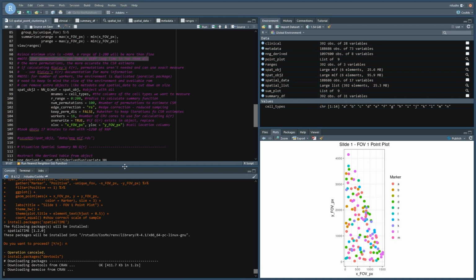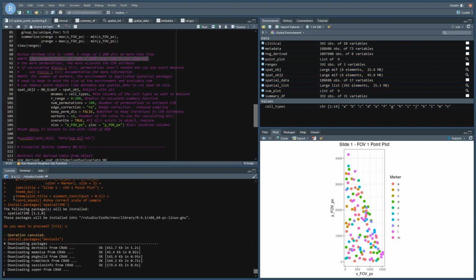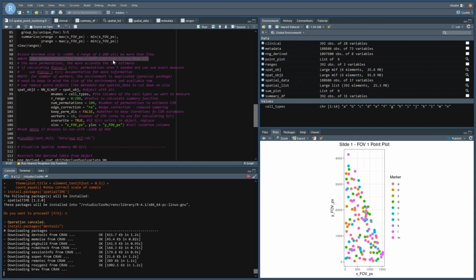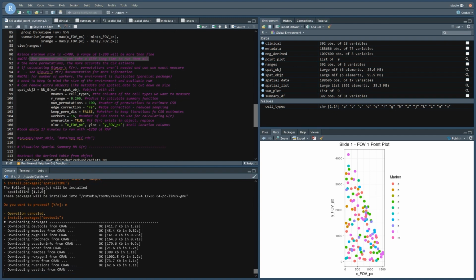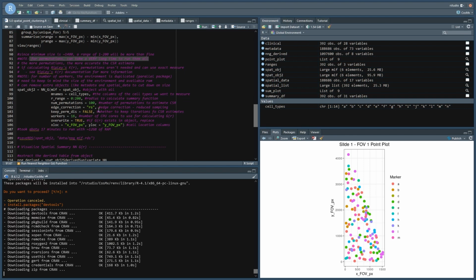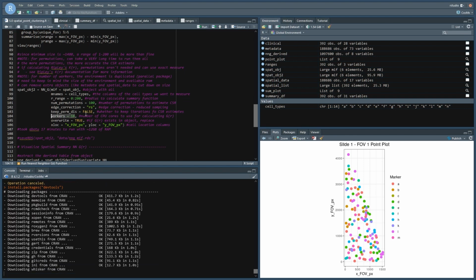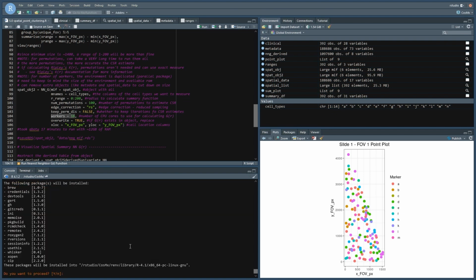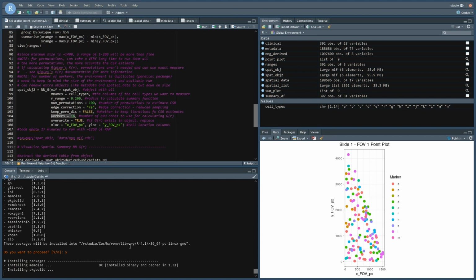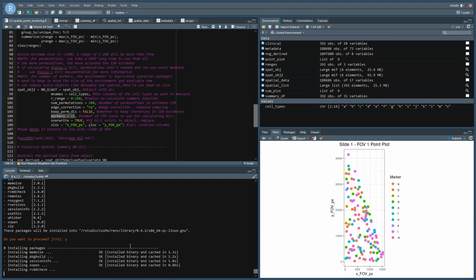So as that's going, I'll keep talking here, and then we can look at the different functions, and I can say the difference between the permutations. There's an exact measure as well for univariate Ripley's K and bivariate Ripley's K. The number of workers, this is where at the beginning I was talking about how the number of cores on Windows is often limited, and that can be a hindrance when you have to do some of these very compute-heavy or time-consuming things.